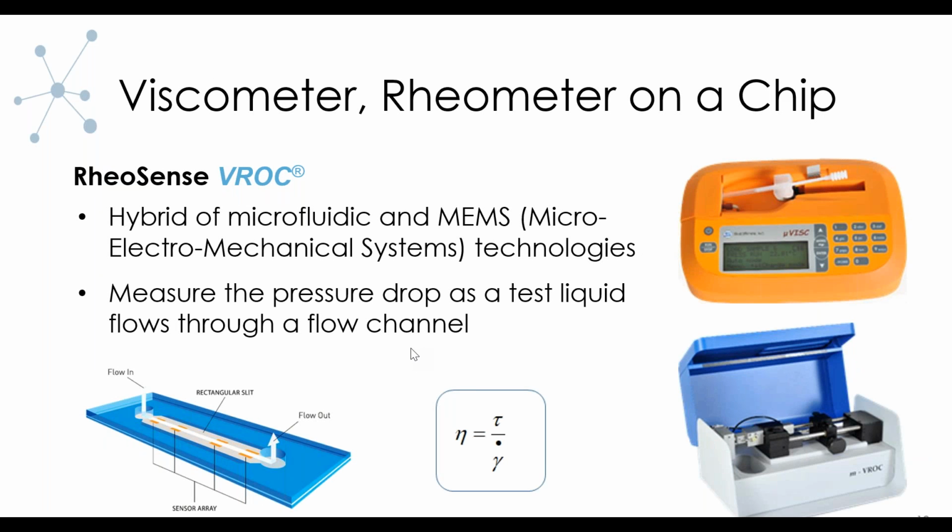The next evolution is viscometers that are VROC, viscometer-rheometer-on-a-chip. That is a technology that RheoSense developed. Some of the advantages of VROC technology are that it is based on microfluidics and MEMS. With this technology, sample volume is much less because of microfluidics, and MEMS allows for a flow-through design, so you can reach higher shear rates.